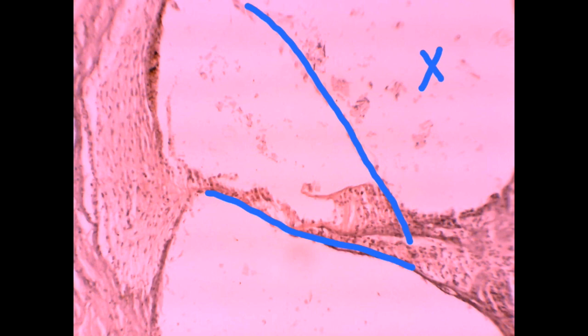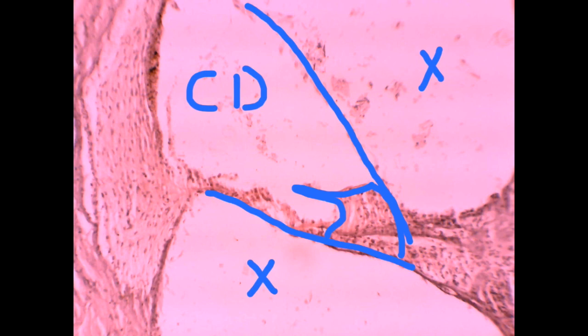Corti. So if you have this membrane here, this is the basilar membrane, and this is the vestibular, and here we have the scala vestibuli, here we have the scala tympani, and here we have the cochlear duct or the scala media. Here we have the tectorial membrane, which is supportive, and under this tectorial membrane we have the cells of the organ of Corti.